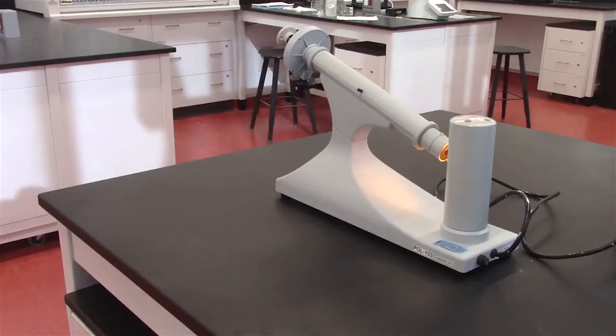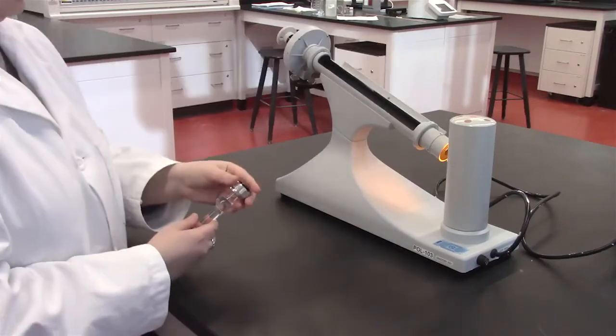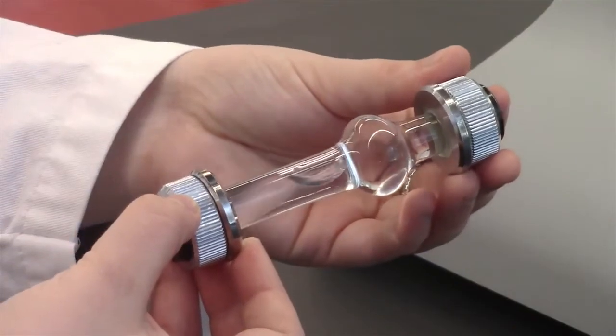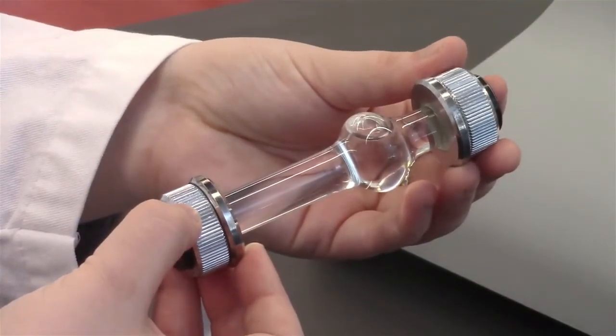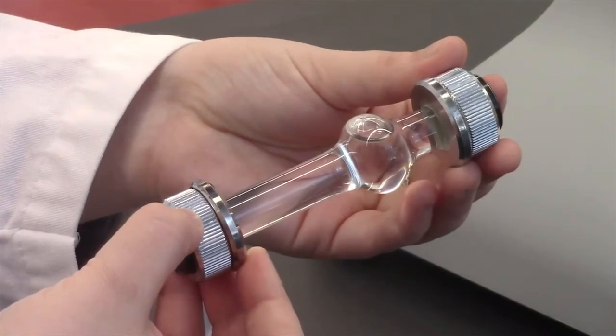If there are bubbles present, tilt the sample holder to ensure the bubbles are in the curved part of the holder and not in the top or bottom of the sample holder.